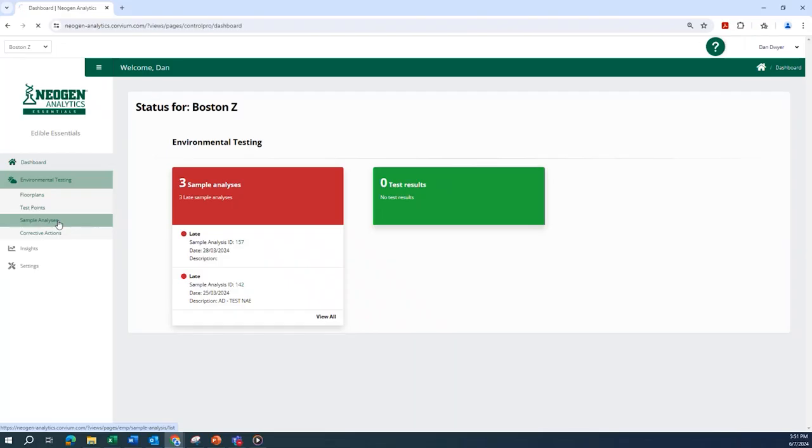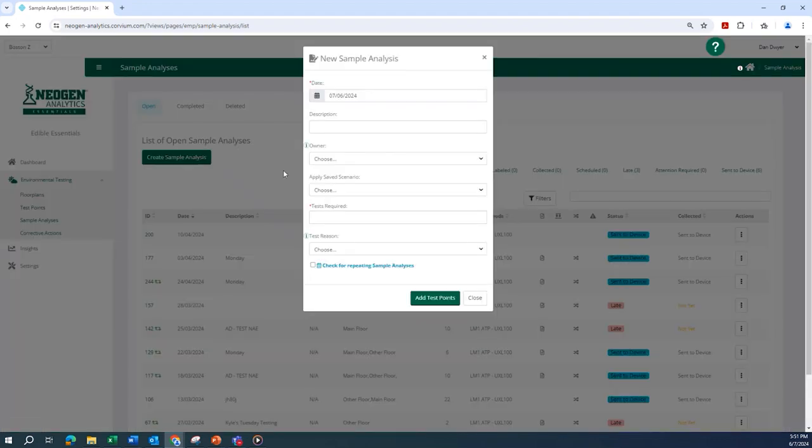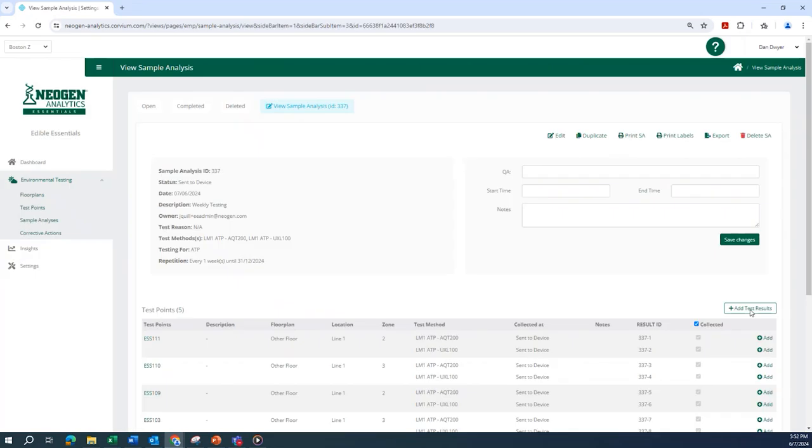To create a testing schedule, select sample analyses under environmental testing in the left hand menu. Select create sample analysis and you will be prompted to complete plan details. When ready, select add test points to include specific swabbing locations to the schedule.